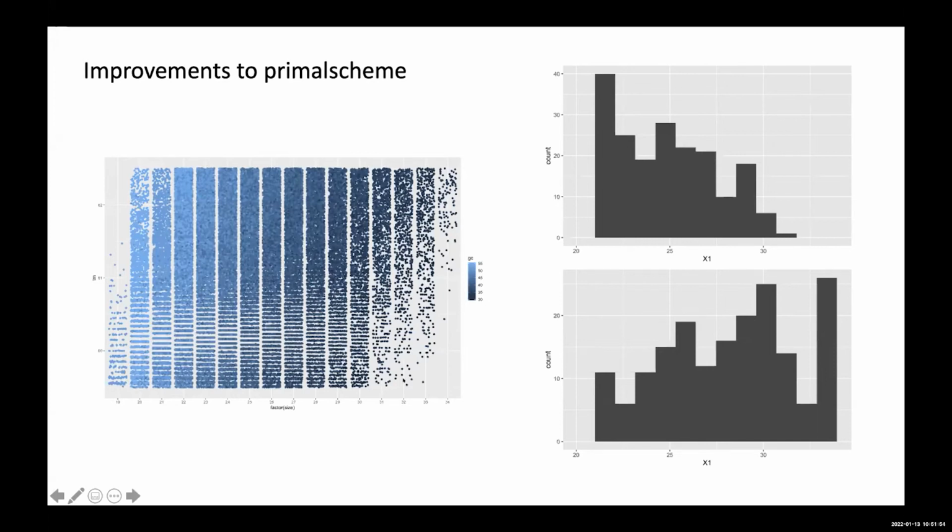And then if you look at the sizes of these, they are just randomly generated k-mers, and then they're colored by their GC content. So you can see that the higher GC content is obviously shorter, because of 3 hydrogen bonds per base, and then the lower GC requires longer. If you consider the local context of the GC within your genome, that's going to change within this range. So we've now made it so that we don't apply any dogma in terms of ideal primer length anymore.